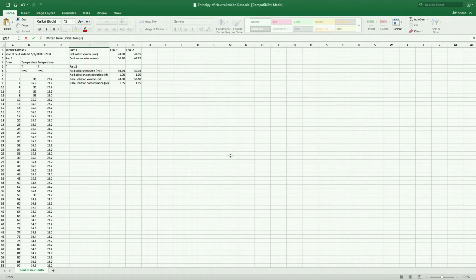This is a good lab. I pretty much tell everyone after each trial, just go wash your hands really good, or just before you leave the lab, make sure you wash your hands thoroughly before you go do anything else. None of the concentrations, especially once you've diluted the acid, are so high that they're really hazardous to work with if you get a little bit on yourself. But they can be hazardous if you leave them exposed to your skin for a long period of time. And so that's just the biggest thing that we usually look out for.